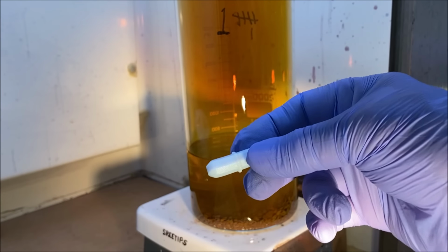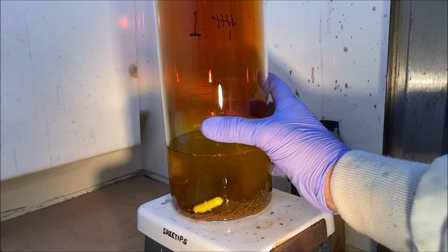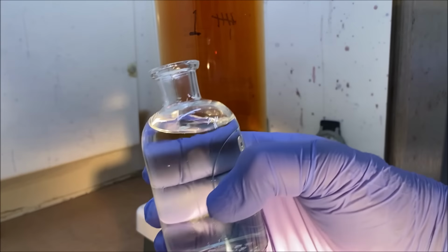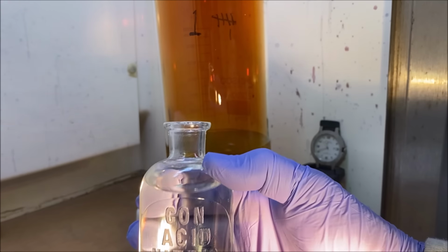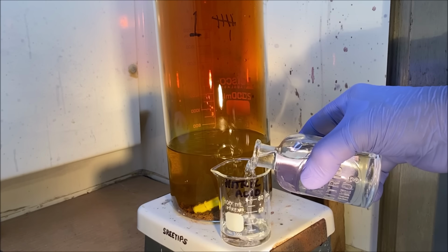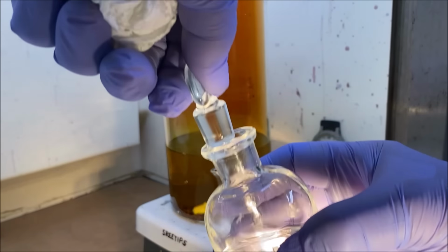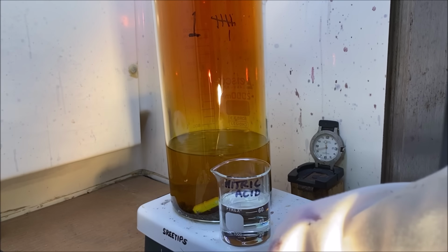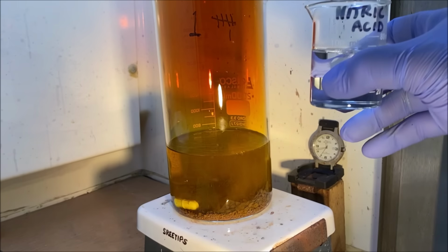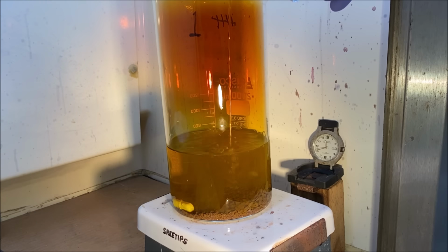I'm going to drop in a stir bar. Got about 6 troy ounces of gold in here. What we'll do is measure out, I'm going to go with about 60 milliliters of nitric acid. Turn the stir bar on. And what I'll do is add about half of our nitric acid in here. And then we'll just let it react. I'm going to put it on time lapse and let it react.